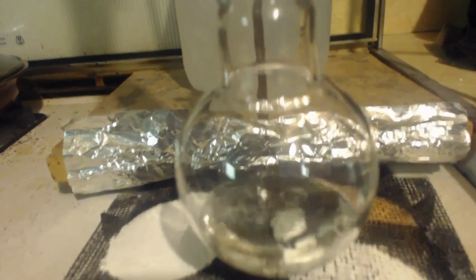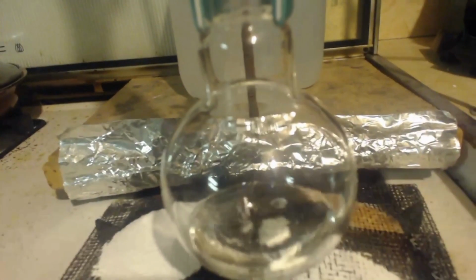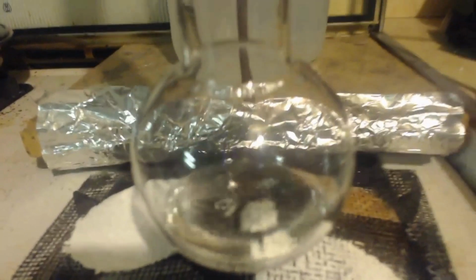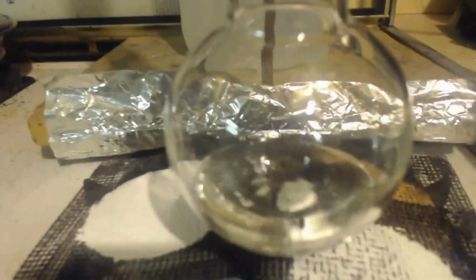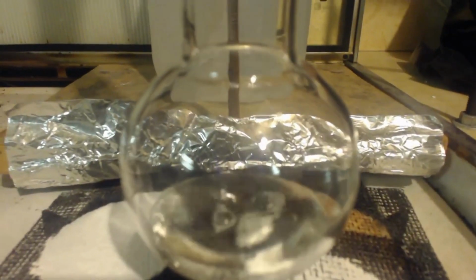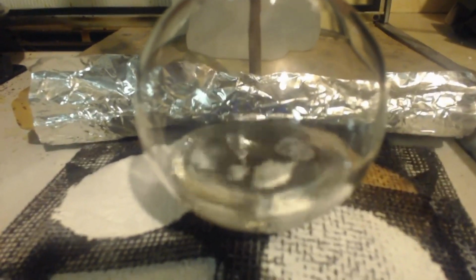That was crazy. As soon as I started up the experiment, I could smell chlorine, man. I mean, that stuff just permeates. So I don't expect it to, and plus I wasn't boiling it. So as soon as it bubbled through, it just went through. There wasn't any vapor really in the air inside the apparatus. You know what I mean? It only had like a second to react, if that, it was bubbling so much through at the time.